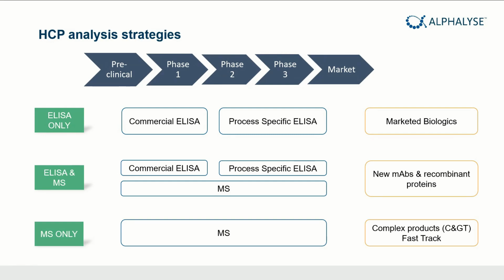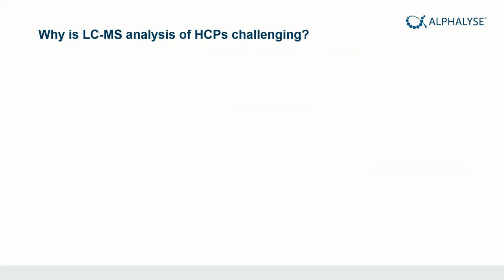So this seems so obvious. So why has this not been done before? So why is it so challenging to do LC-MS analysis of HCPs, and why is it difficult to do in a quality controlled environment under GMP?